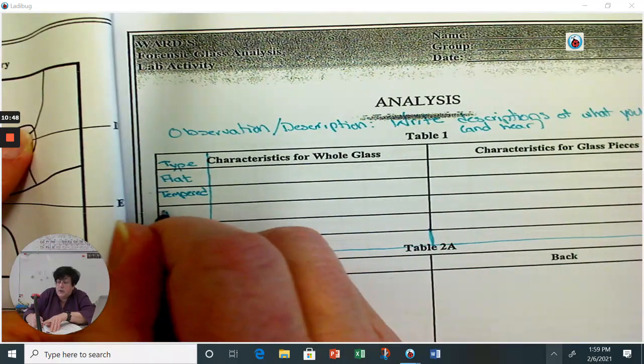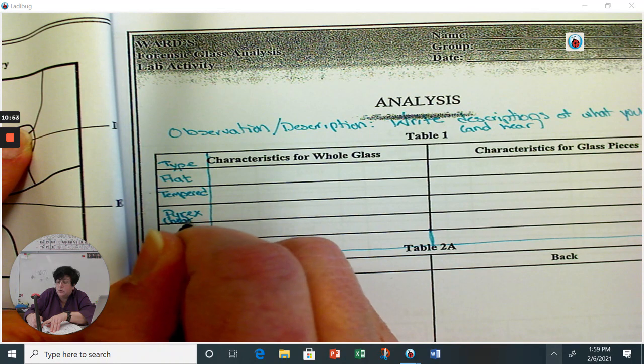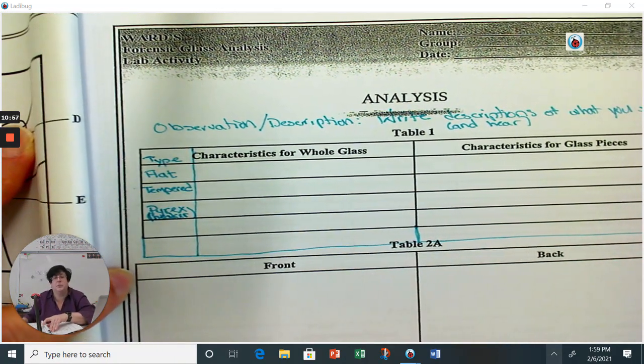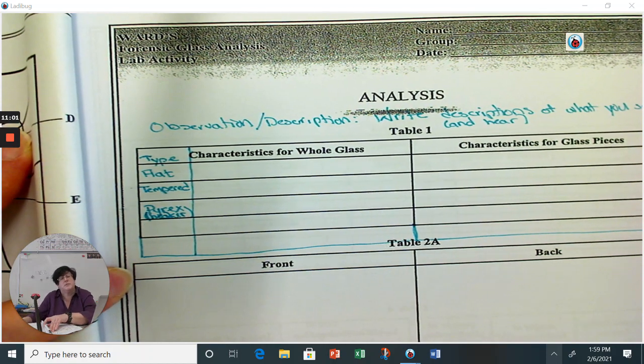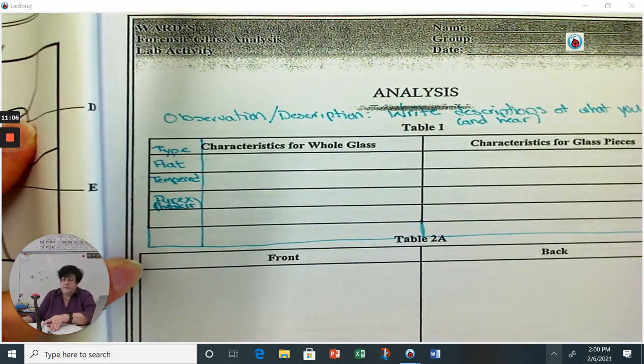We are going to look at Pyrex, which will be a beaker, because I have so many. Mr. Kroll is great. Every time somebody in his classroom chips a beaker and we have to throw it out because you're not supposed to use it, he brings it down to me so I can smash the beaker for you, and you can smash beakers, right?